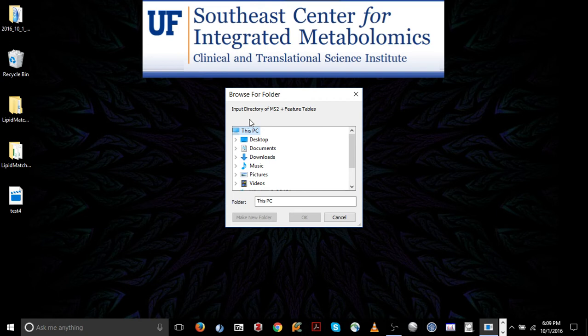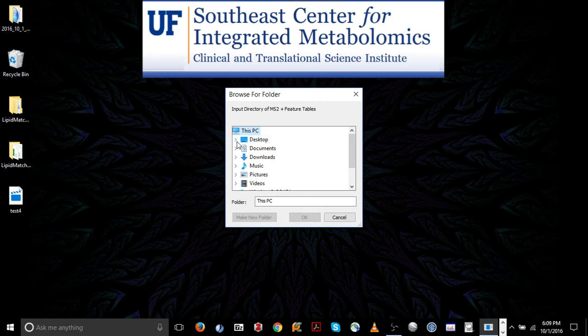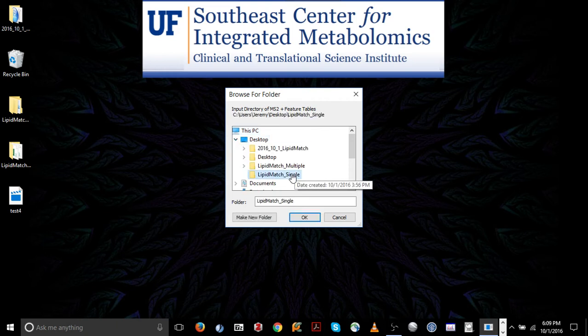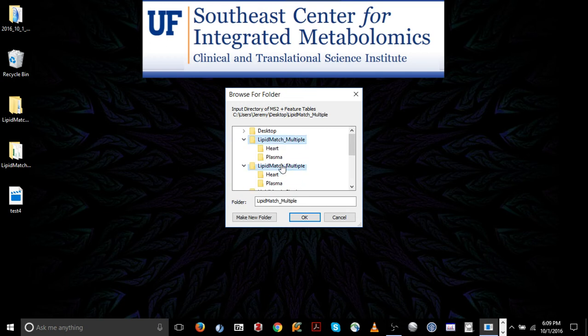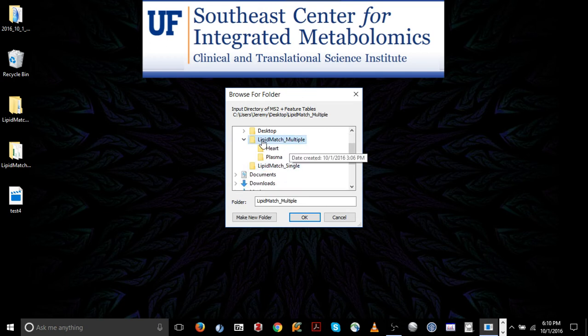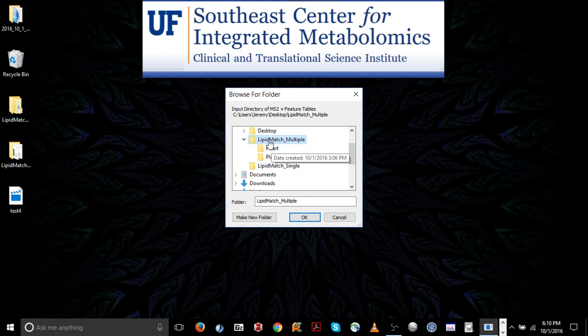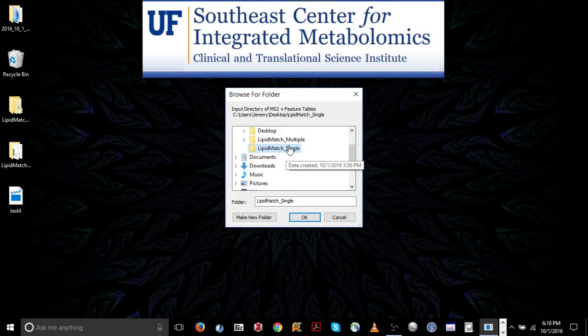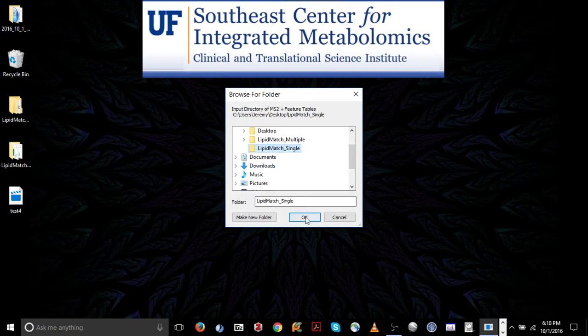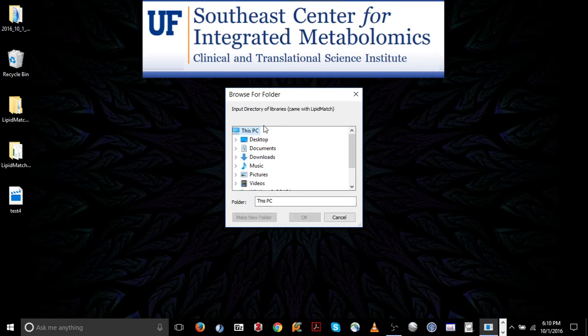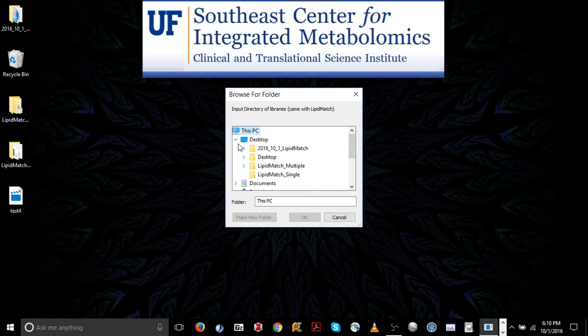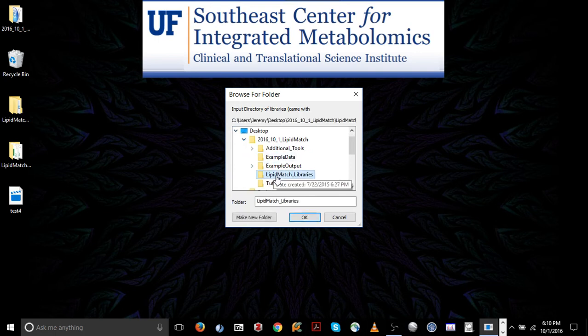Now to input your directory of MSMS and Feature Tables, which was the folder that we discussed earlier, we have to navigate to it. So this time it's on our desktop, and let's use the LipidMatch single folder, although we could click the LipidMatch multiple folder, in which case if we were running multiple files, we'd click the parent directory that holds all the other folders in it, so this one. In this case, we just click the folder. Now, the input directory of libraries, which is contained within the LipidMatch folder, is the next folder that we need to import.